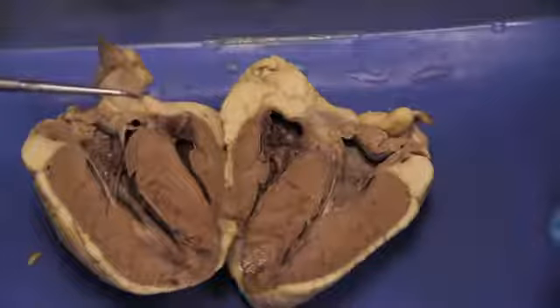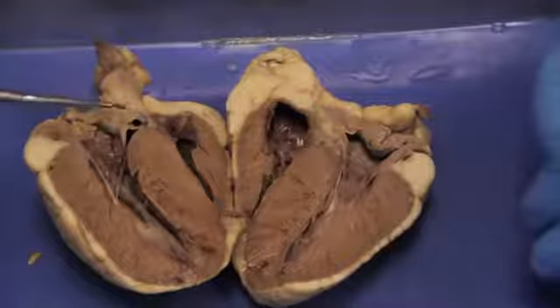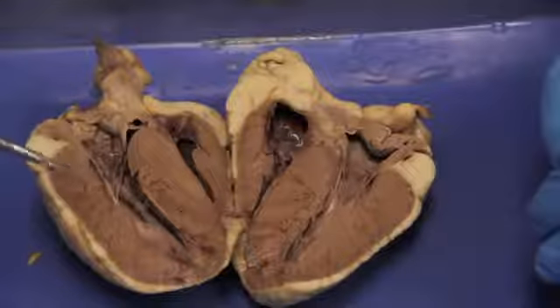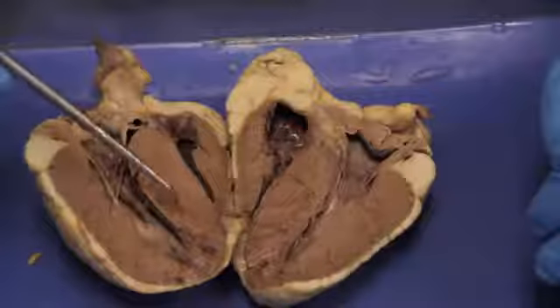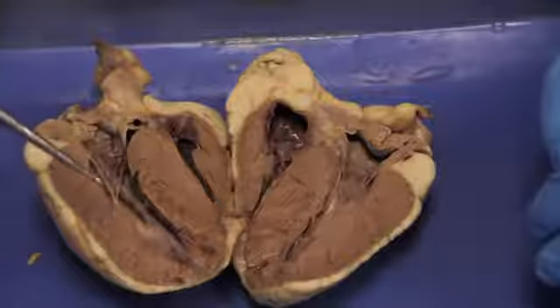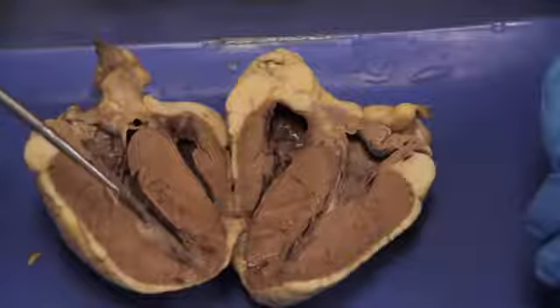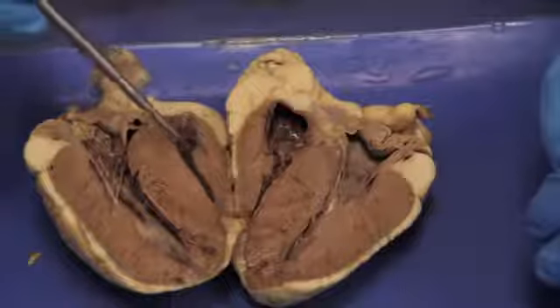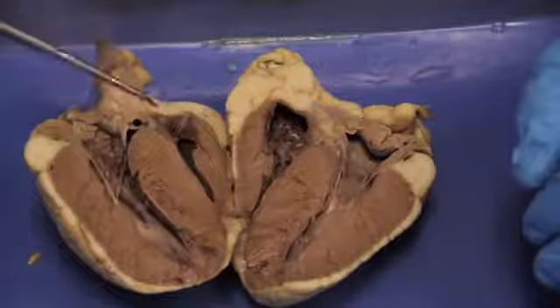Let's pretend that you're a red blood cell in the inferior vena cava, which is right in here. How do I know left and right ventricles in the heart? Well, you can see this myocardium is much thicker than this side. This must be the left ventricle, here and here, because the left ventricle needs to have more force from muscle contraction to be able to eject blood into the aorta, into the body circuit, which is much longer than the pulmonary circuit, which is done by the right ventricle, here and here. So now we know where we're going as our red blood cell.